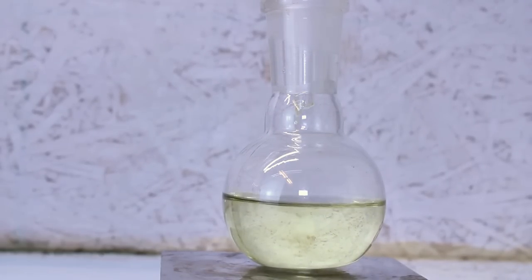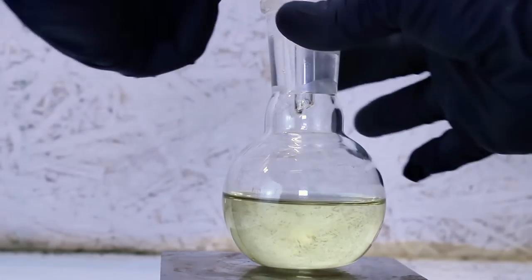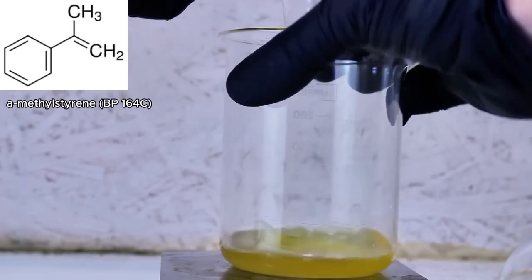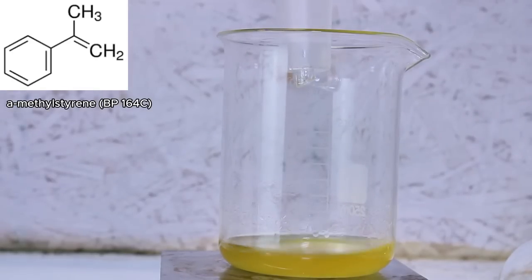This is important because at around 164 degrees celsius, the next waste product, alpha-methyl styrene, will begin to distill over, and you don't want that.